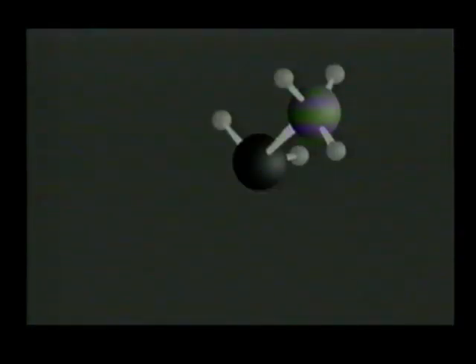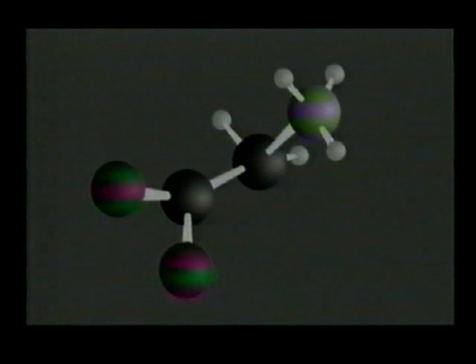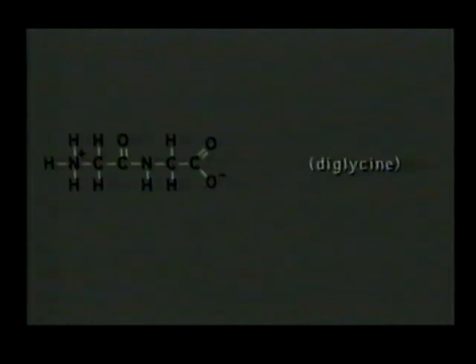The double-charged cation will be detected first, as it has greater mobility than the ion with a single positive charge. In a situation in which a sample contains several cations of differing size, but all carrying the same charge of +1, the smallest cation will elute first, due to it having the highest mobility.